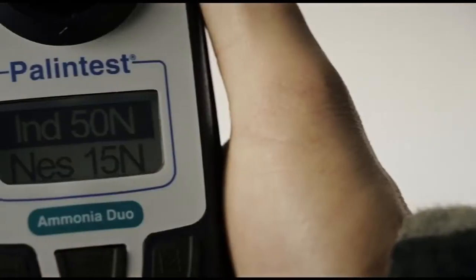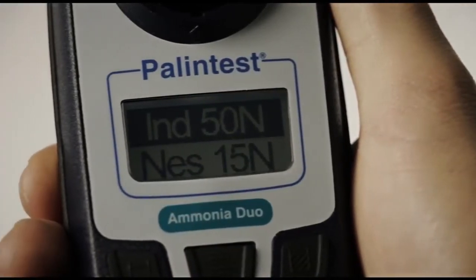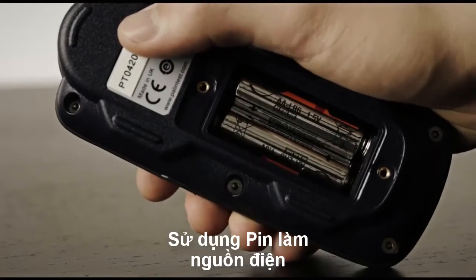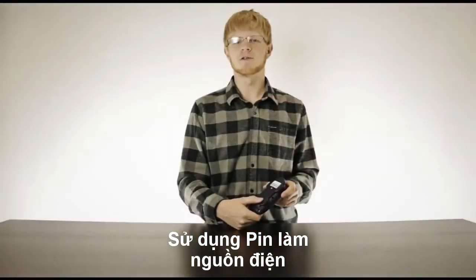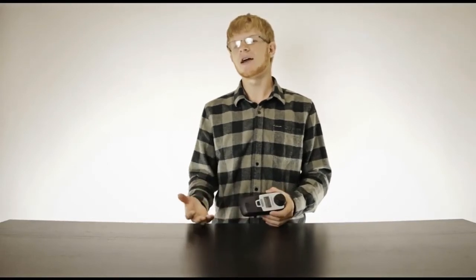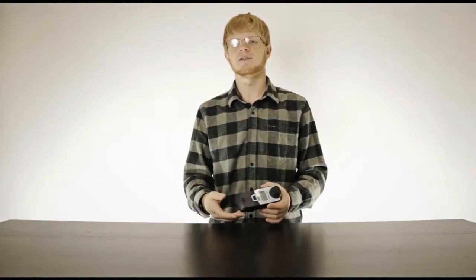The Ammonia Duo features a large backlit display, and the whole device is IP67 certified, so if you want to take it swimming, be our guest. It's powered by two AA batteries, easily changed when the rear door is removed, and the instrument maintains the ten most recent samples, maintaining the blank until either turned off or reset.